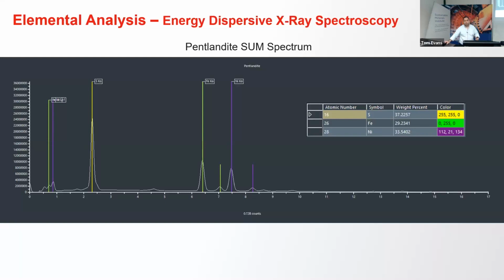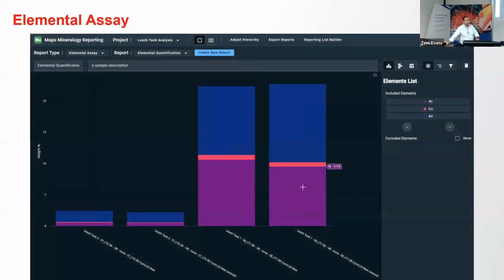And these are the results that will be used later on for the rest of the reports. Basically, the reports are just an interrogation of a database. Good thing, when we're talking academia or research institutes, all the information is safe on an SQL database. So most universities are more keen to develop their own or interrogate the data themselves. So you can go into the SQL database directly.